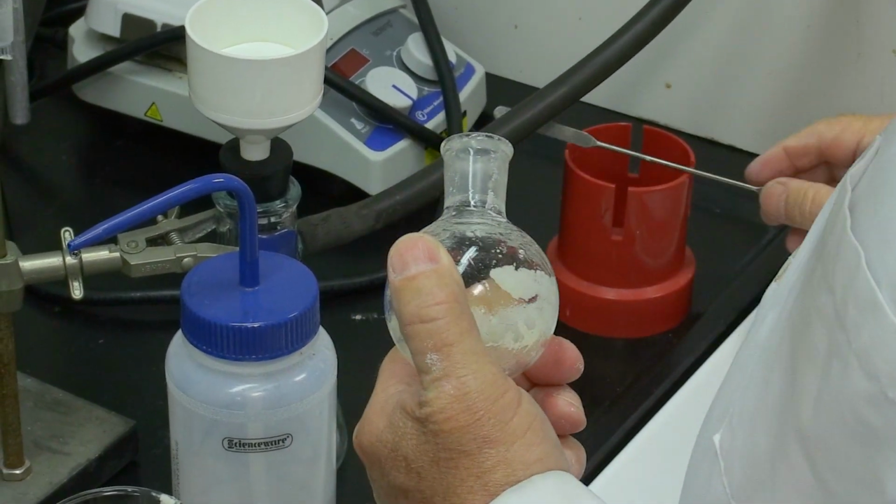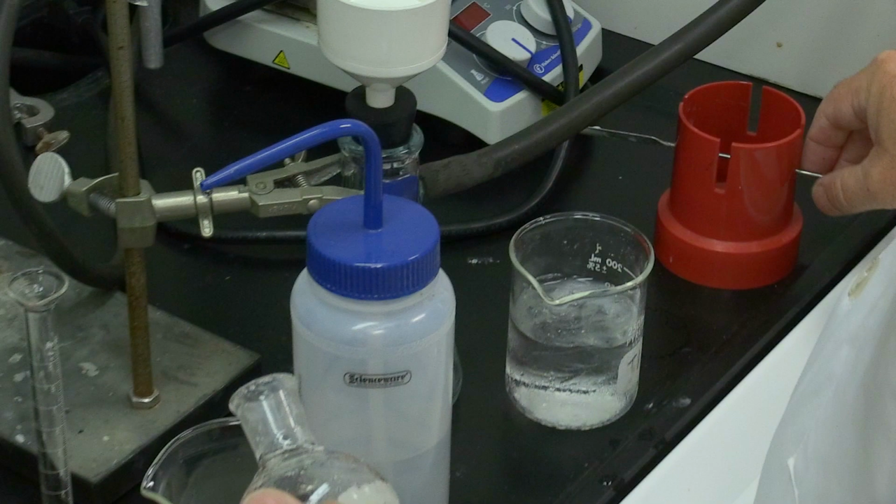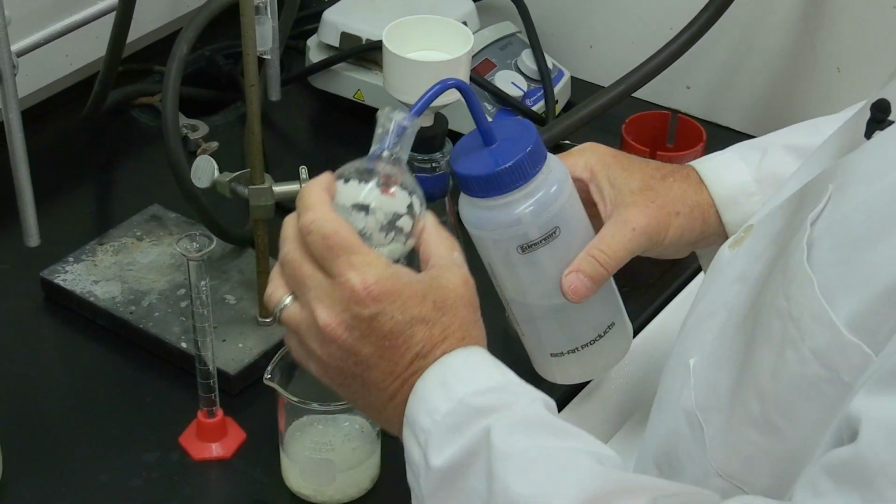Sometimes we don't cool it until after we transfer it, but we did it this way this time.